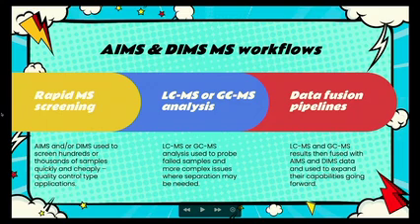So, right, okay, let's measure how much is there accurately with an LCMS technique. Perhaps you've got an ISO accredited technique that you need to use. You know, then throw it in that direction. Then it's possible, and Nicolas in particular will tell you about this, the data fusion and how we can make use of the data that we gain from the rapid analysis to drive how we work with the more conventional analysis as well.